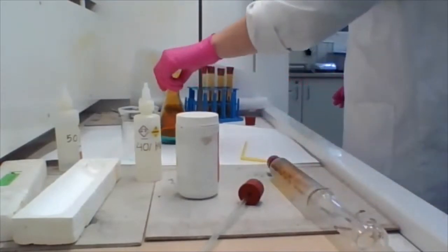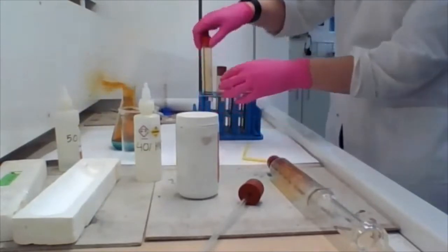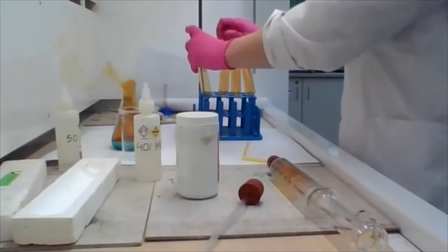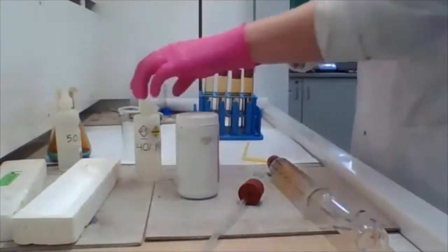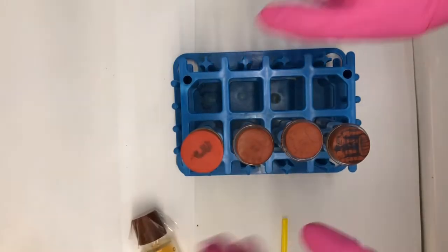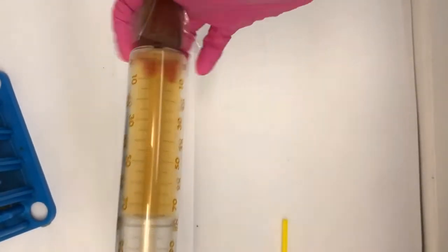So I'm just going to pop that off to the side, pop that cylinder out of the way. And then I've got my 4 test tubes there. I think I've also got that angle on the phone camera later. That very stereotypical copper blue solution. And just tidying up a little bit. So all I've got here is I am demonstrating the colours of those test tubes that I filled up and my gas syringe.